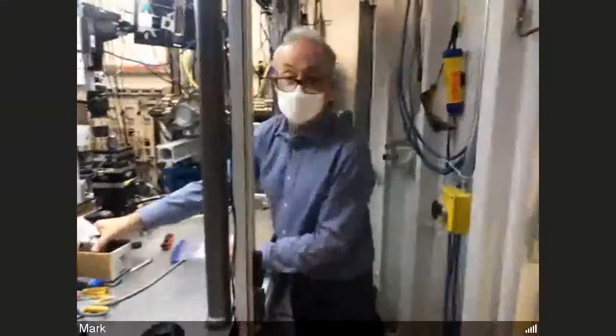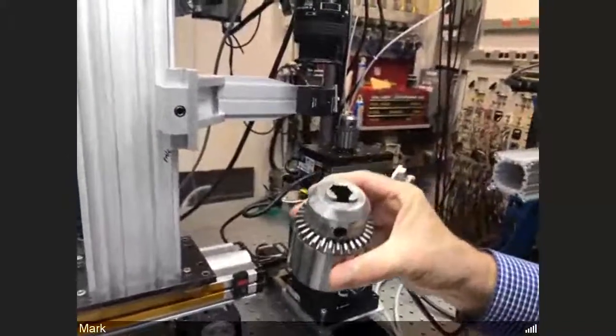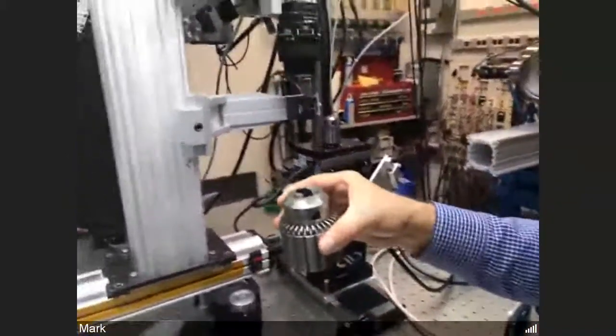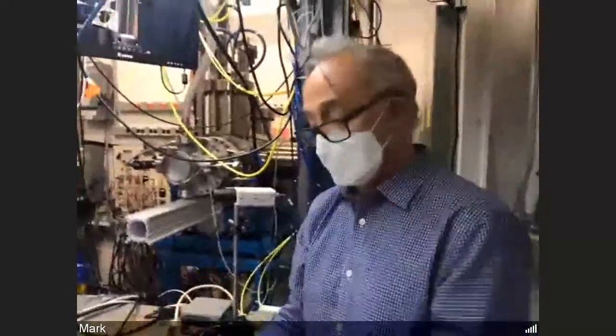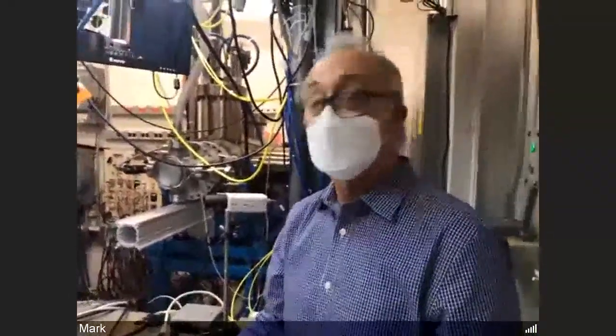So, as I said, there are a variety of ways to mount samples here. This is the smallest drill chuck we've got. This is the largest drill chuck we have. And then many people bring their own specialized apparatus that mounts directly to the stage. And that new stage that I showed you with the hexapod and the air bearing will be able to handle significantly larger and taller apparatus than this one.